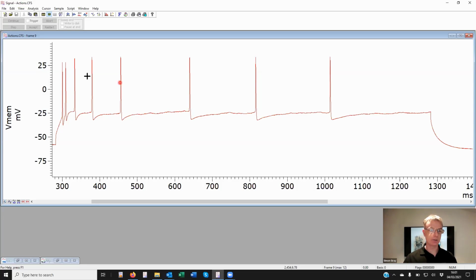That's copied as floating point numbers. So this is scaled to roughly between -50 and 25. They happen to be millivolts here, but the units will be ignored when we come to use this.